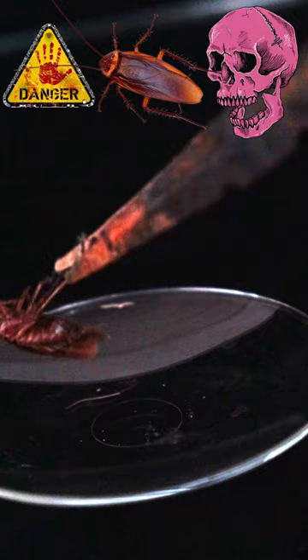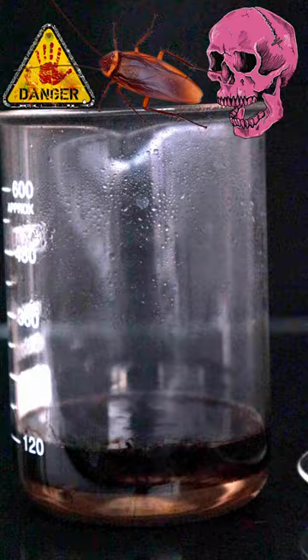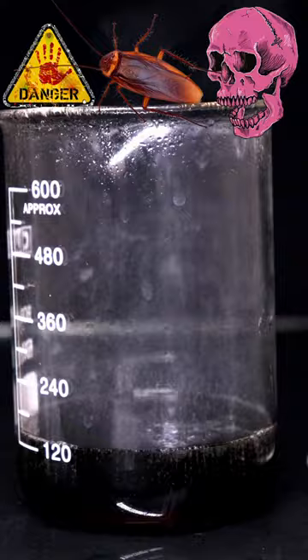And this is our deadly volunteer cockroach. The cockroach will dissolve immediately when we add it to this solution. Piranha solution turns anything organic — even humans — into carbon, gas, and water.